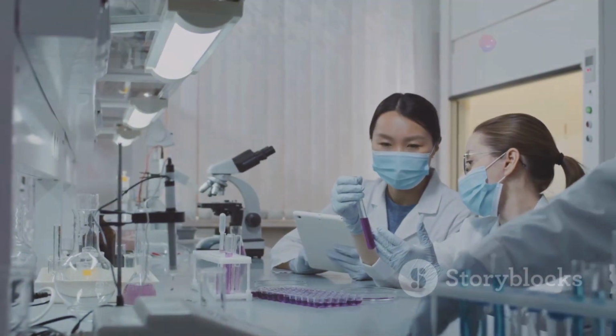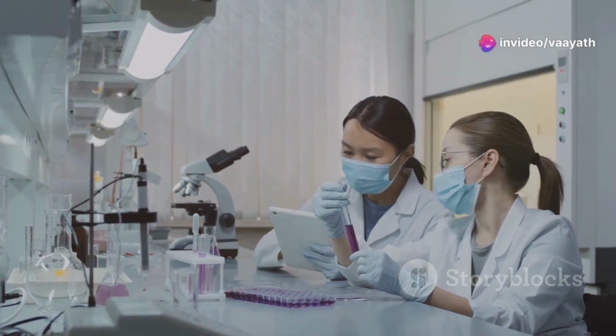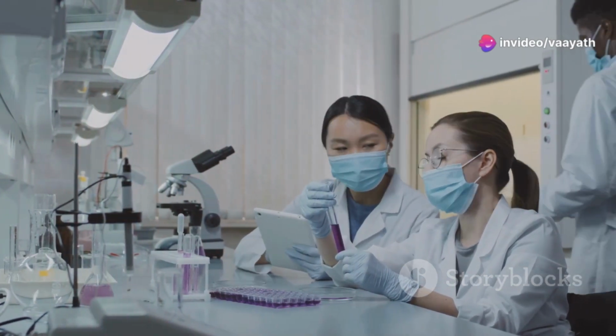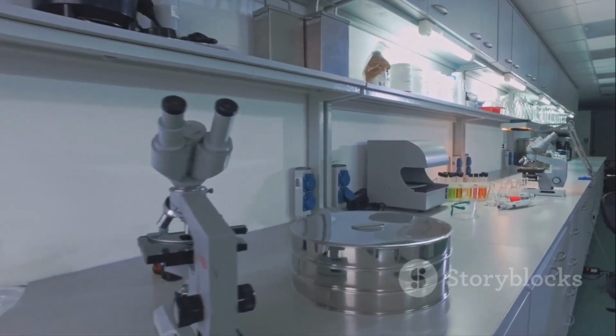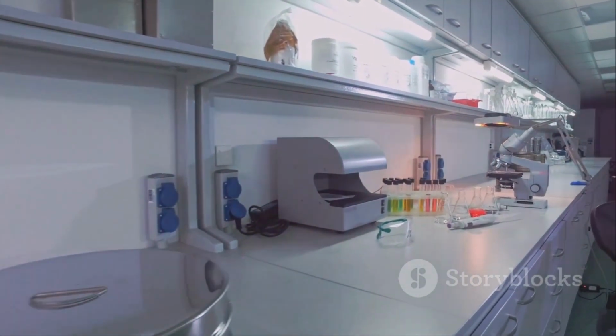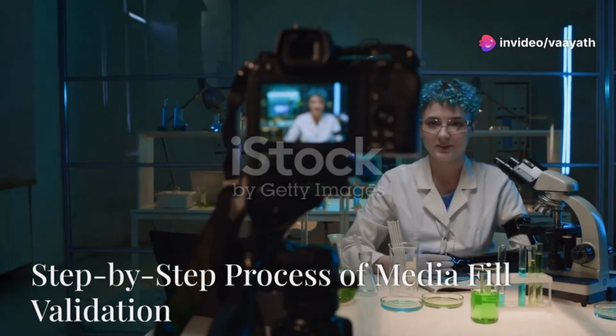Trained microbiologists are essential for designing and executing the validation study, analyzing the results, and providing expert interpretation. Collaboration between quality assurance, manufacturing, and microbiology departments is crucial for a successful media fill validation.